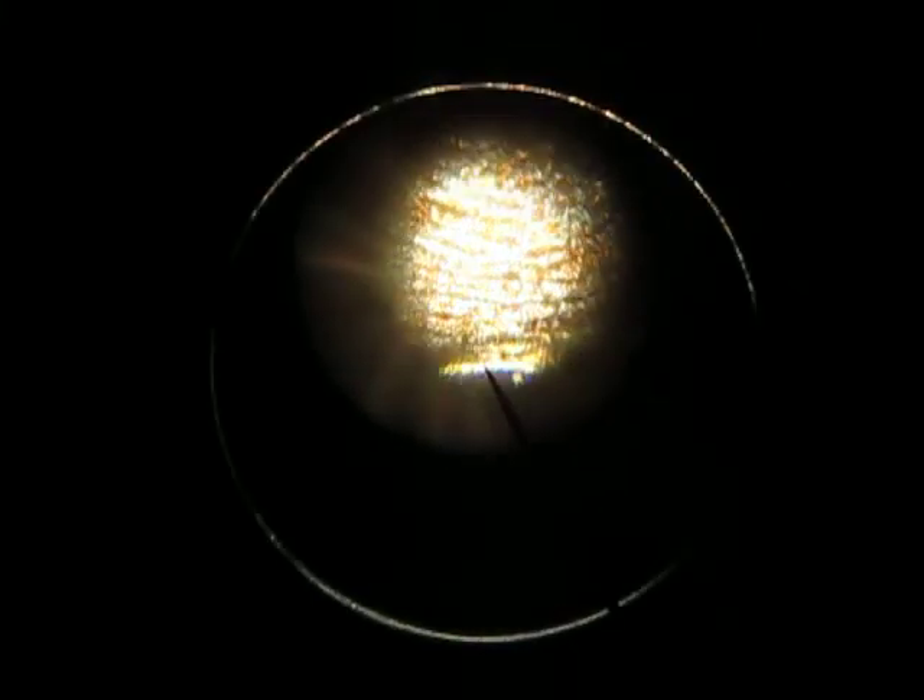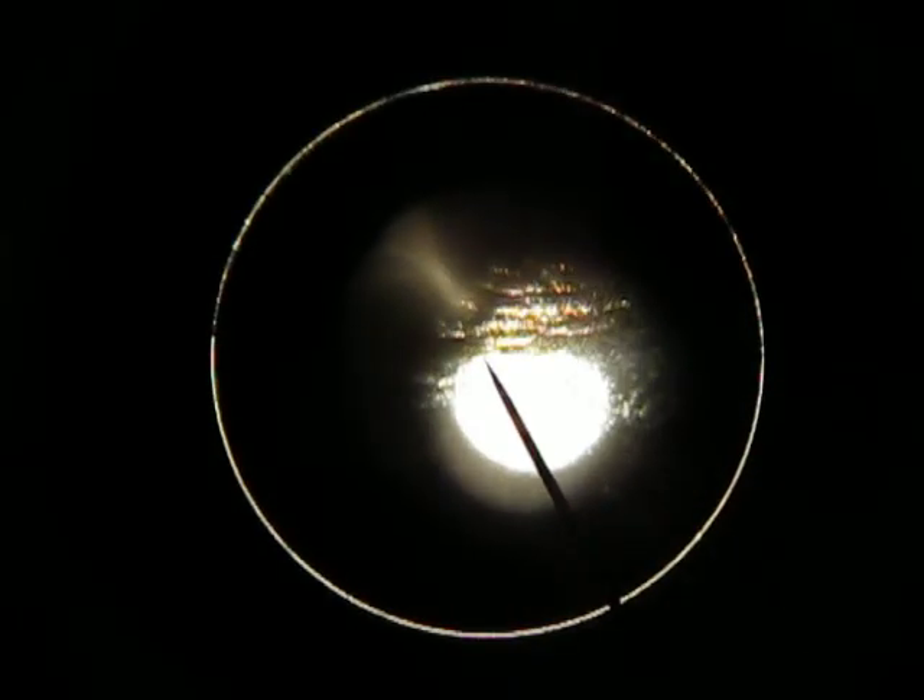What I see are tiny, itty-bitty round circles that basically look like oil drops. They're a little bit out of focus. I think it's bacteria. I was a veterinary assistant for three years before I moved up here, and I used to be the queen of stool samples, so I'm well versed in what bacteria looks like, as well as other intestinal parasites. There has been absolutely nothing wriggling, nothing moving, nothing to indicate a parasite. Could it be a fungus? Maybe. Having a hard time identifying it.